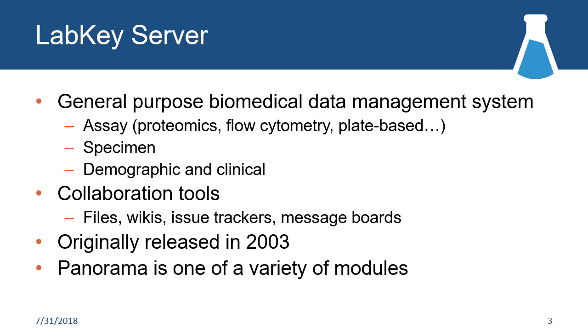What a lot of groups find exciting about it is you can have your analysis results, or your raw data, but then actually connect that back with sample information, with patient or animal or cell line, or other types of data. It's got a handful of collaboration tools, and I think Geisha will be highlighting some of those. And Panorama fits into that overall framework quite well.